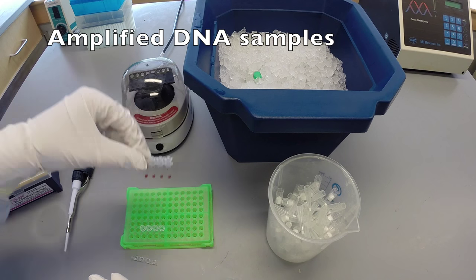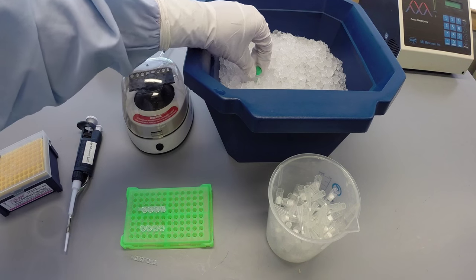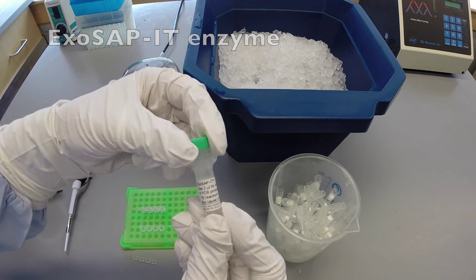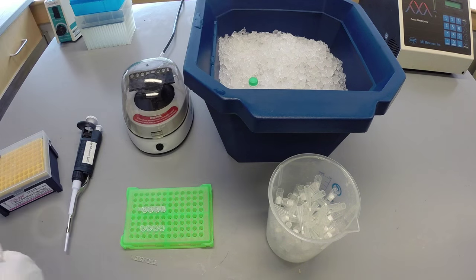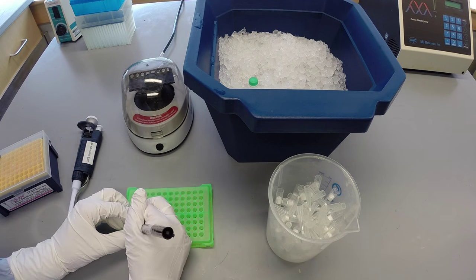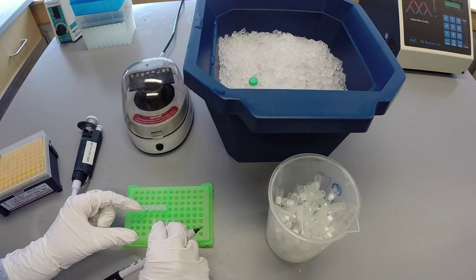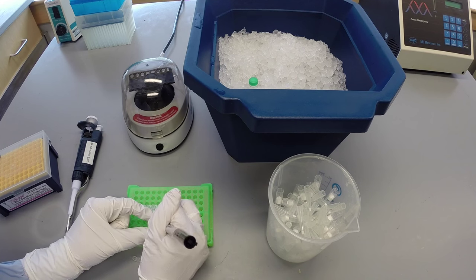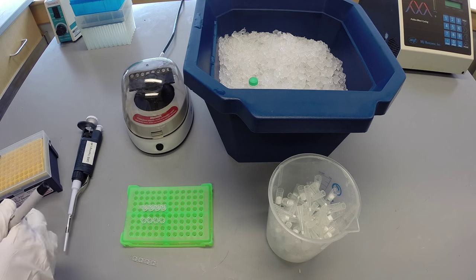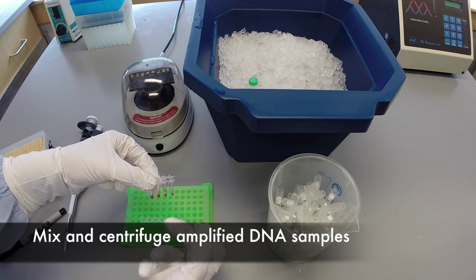You need the amplified samples, new tubes, excluding a negative control, and the ExoSAP-IT enzyme solution, which should remain on ice at all times. Label your new tubes and mix and collect the amplified samples.